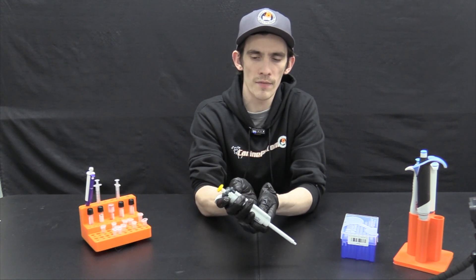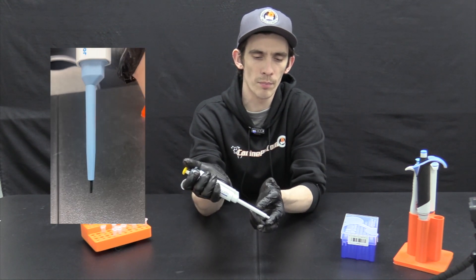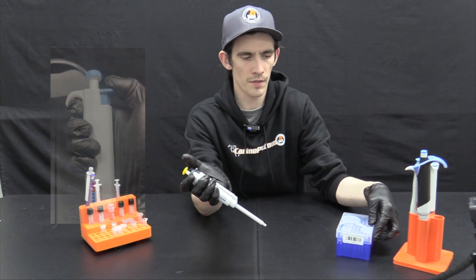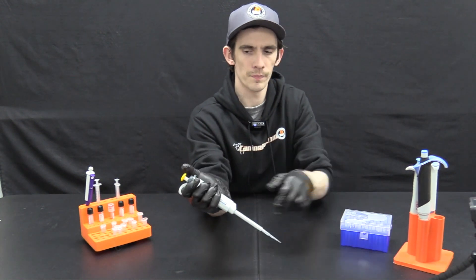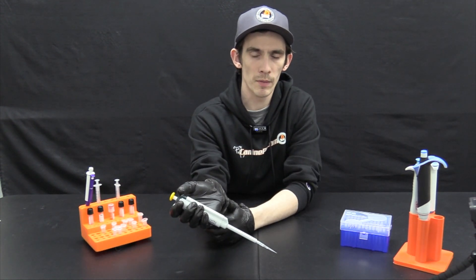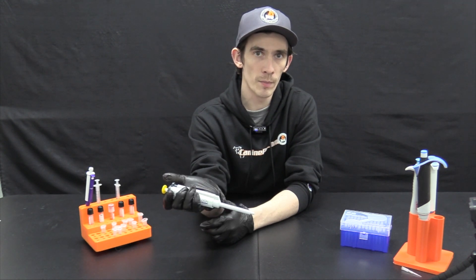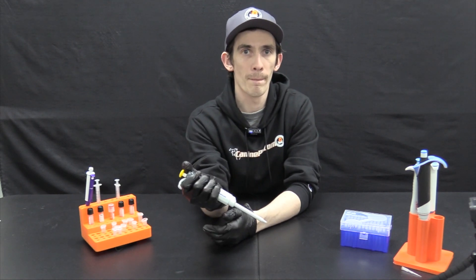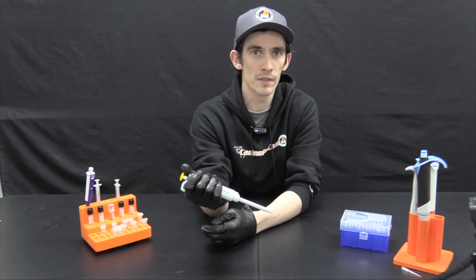Next we have the tip eject button. This is going to remove the tip from the end of your pipette automatically. To demonstrate, I'll place a tip on and then use the tip ejector button to remove it. It's going to be probably best to have this dispensed over a trash can to limit exposure to serums and potentially biologically hazardous materials.